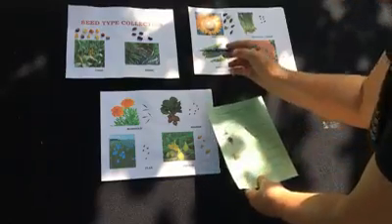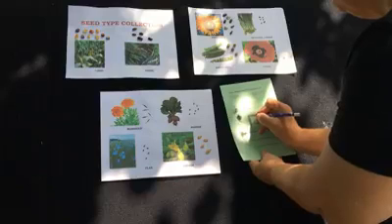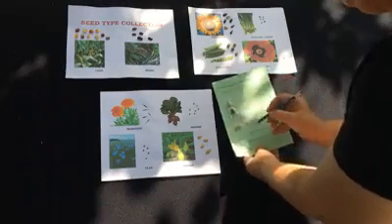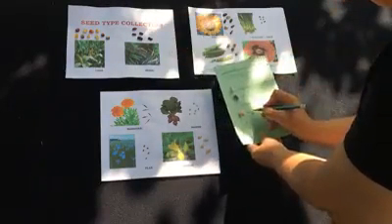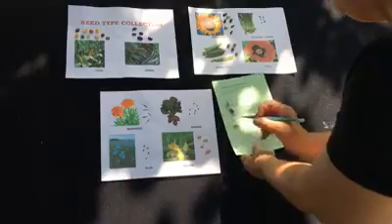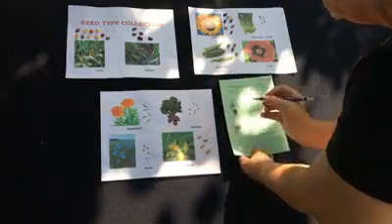Our second type, looking through, looks to be a bean. And again, your student, just get them to write it down. This looks like corn. And then this little smaller seed looks like it's probably flax.